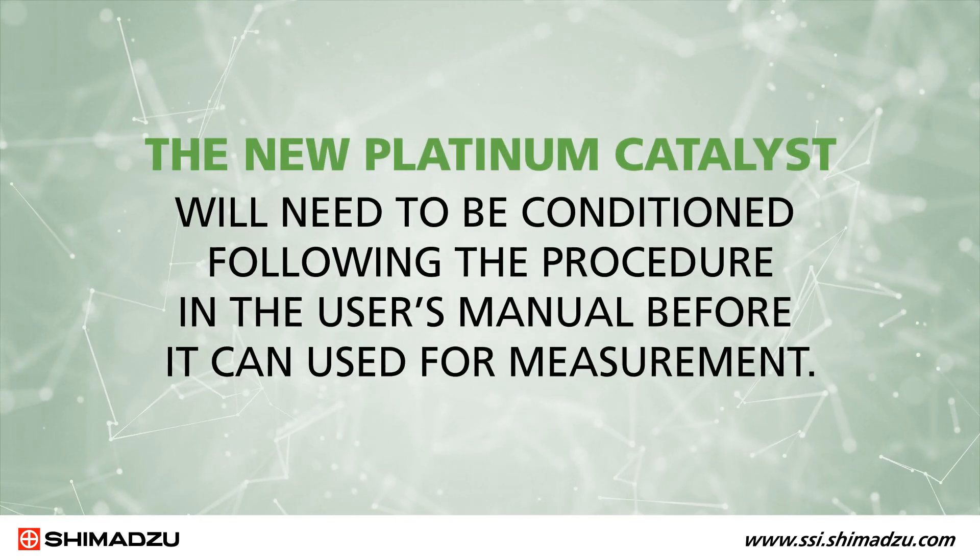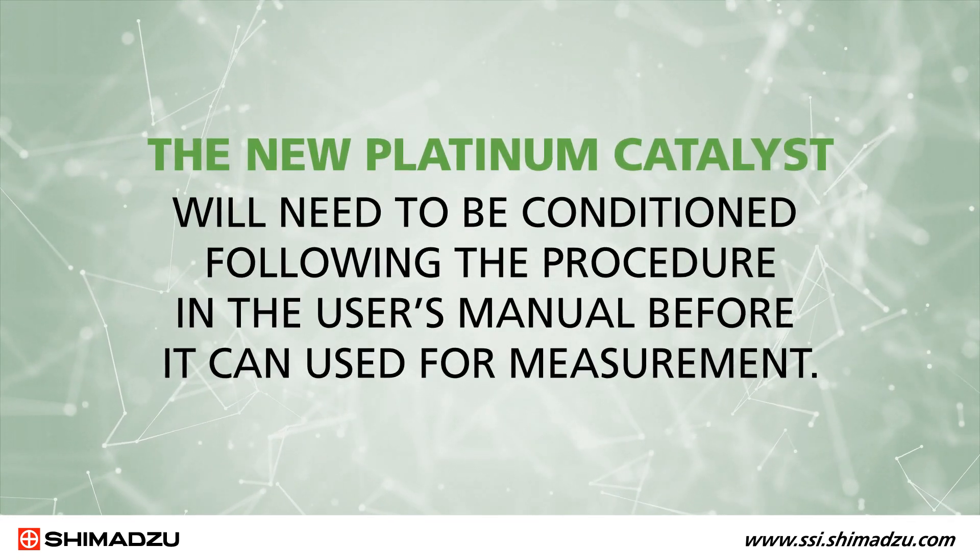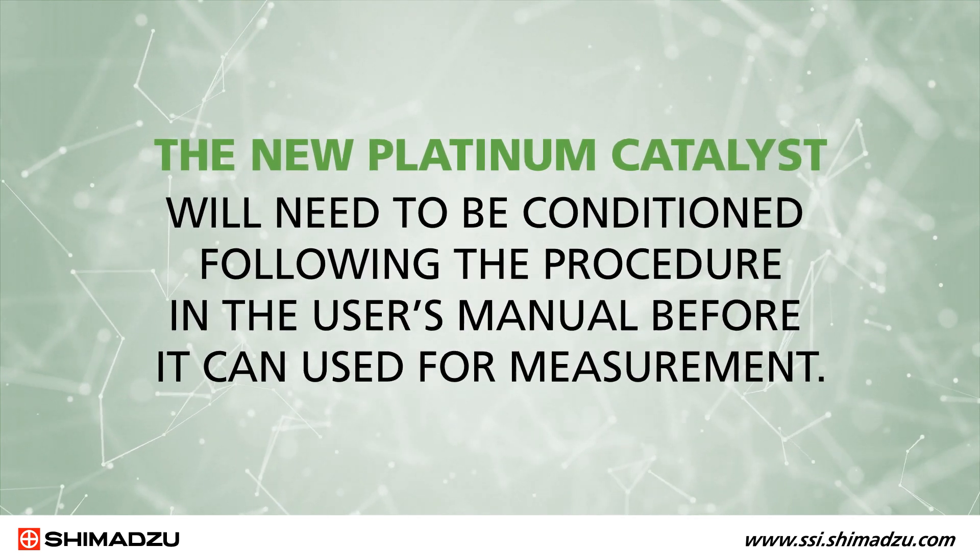Please be aware that new platinum catalyst will need to be conditioned following the procedure in the user's manual before it can be used for measurement.